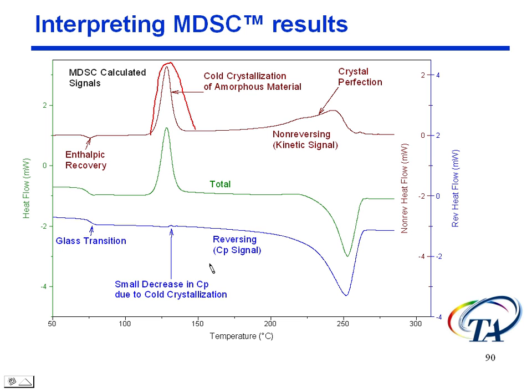Energy gets put into the sample, and it gets to the point where the crystal structure starts to align and crystallize. And that's this exothermic peak we see here. But as we heat up, remember what we saw when we blew it up, we see that it's continuing to crystallize. Why is that? This is called crystal perfection.